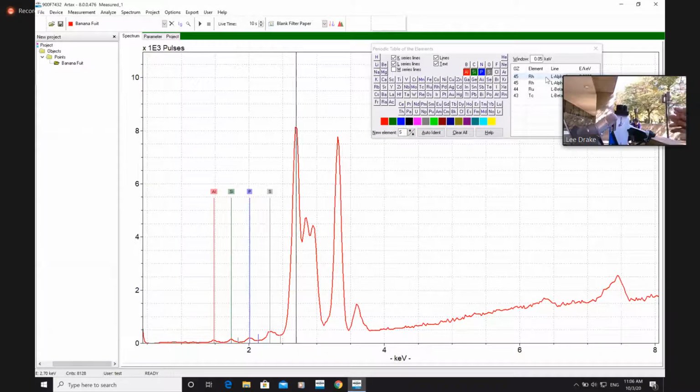See, the thing is, to send any light, you have to have a target inside of a tube. For visible light, when I've got fluorescent light, the target is mercury. You basically put some mercury vapor in the fluorescent tube, electrons smack into the mercury, and then that radiates out and we get visible colored light. Luckily, light bulbs never break, so there's no risk of mercury pollution anywhere. For x-rays, though, we need a very different metal to do this.